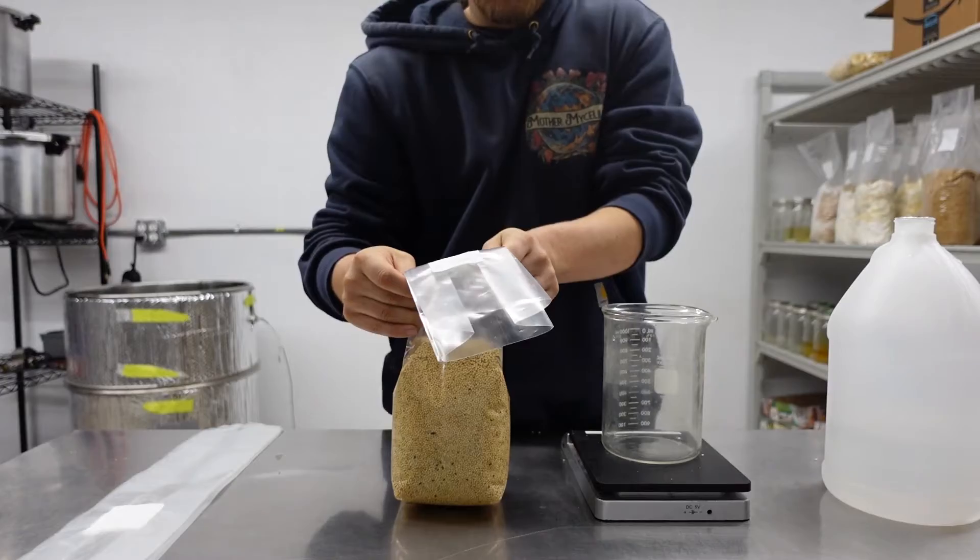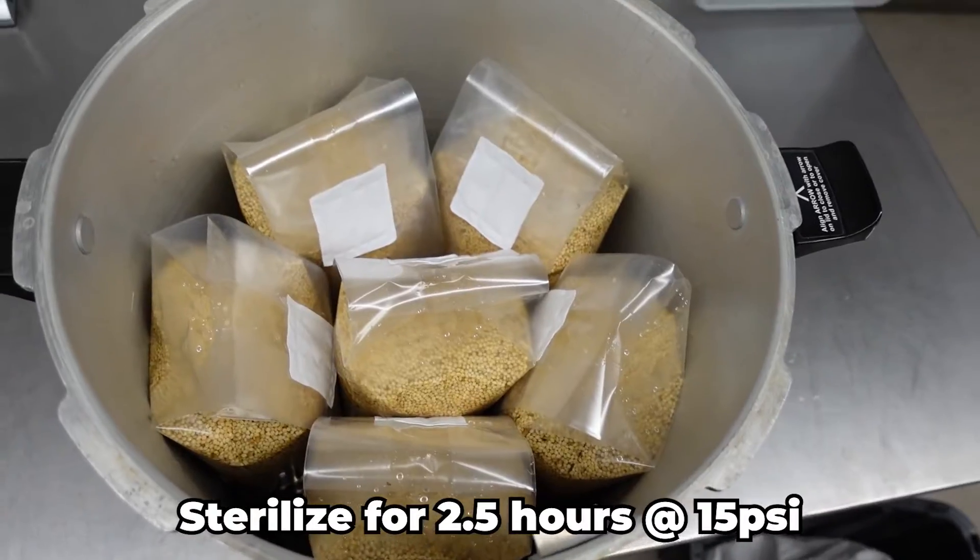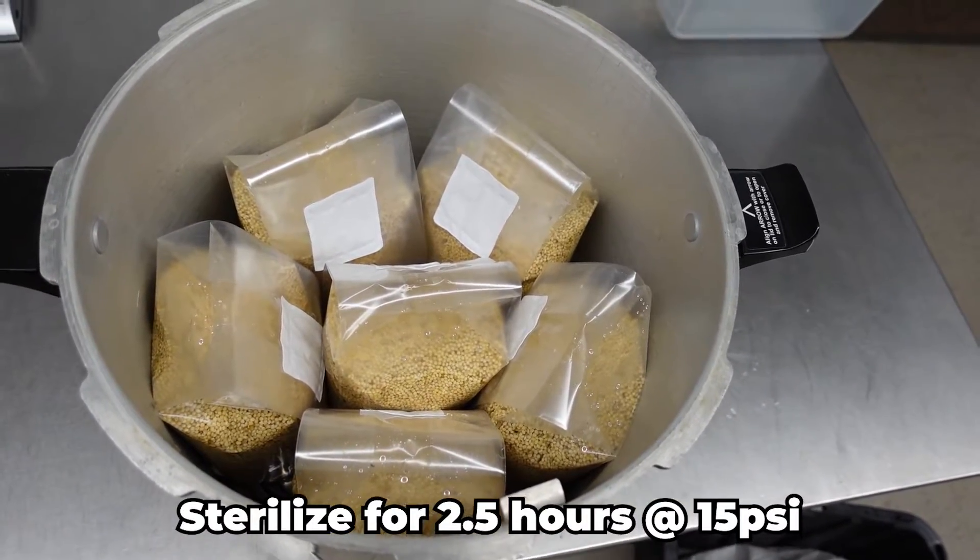Add your grain bags to your pressure cooker and sterilize them for 2.5 hours at 15 psi.